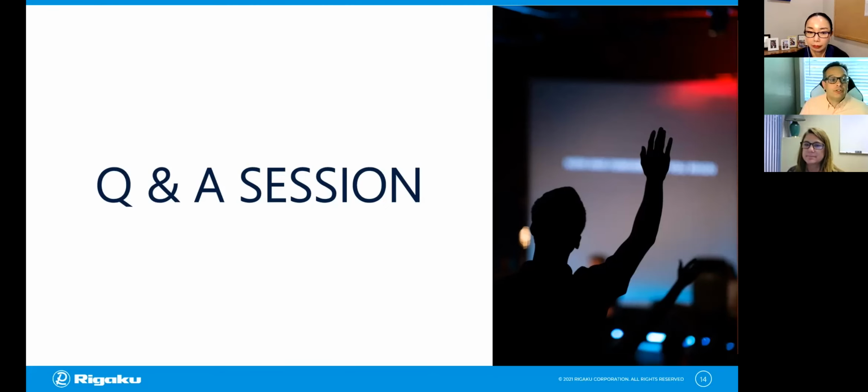So Sarah's question is about comparing time scan data. Is there a way to subtract two scans to view the difference? Say you have a fracture at time 0 versus time 2 hours. It doesn't necessarily have to be in ImageJ, but is there a way to do that?